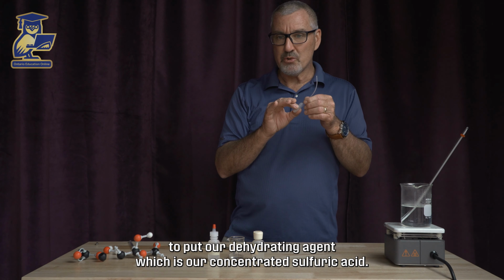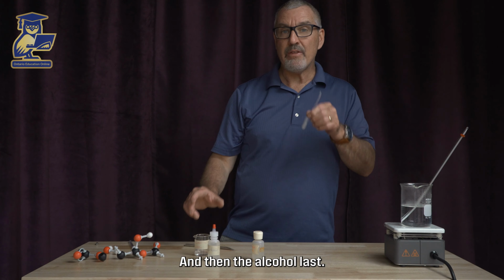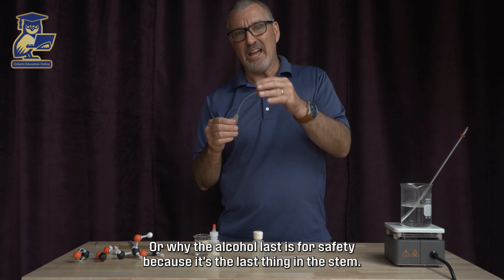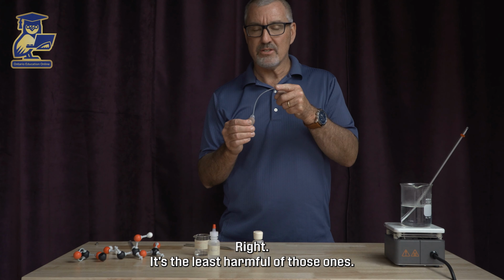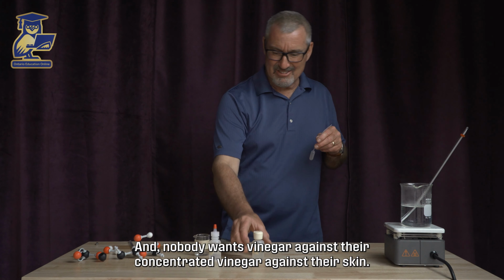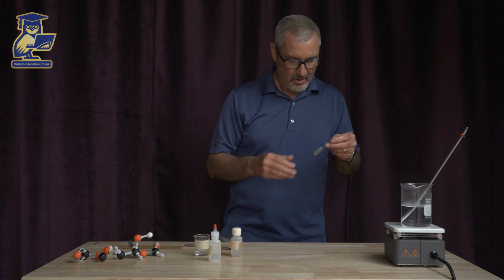Then we're going to put our dehydrating agent, which is our concentrated sulfuric acid. And then the alcohol last. The alcohol goes last for safety, because it's the last thing in the tube. Anything that's going to spurt out, we want it to be the alcohol. It's the least harmful of those. Definitely not the sulfuric acid. And nobody wants concentrated vinegar against their skin.